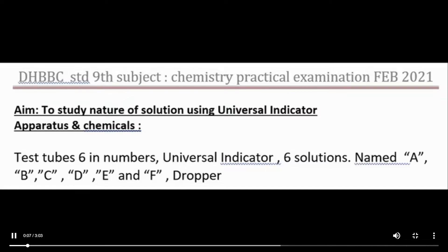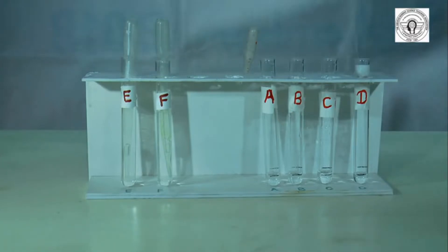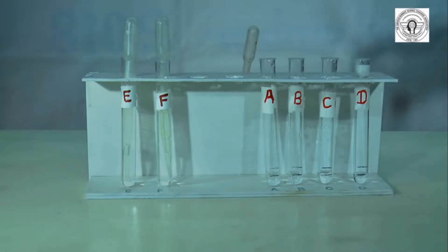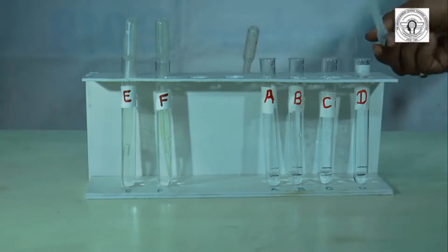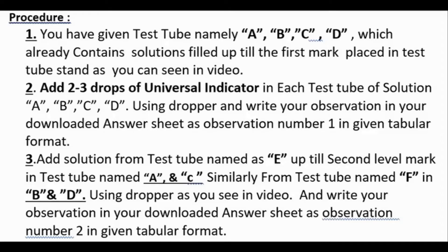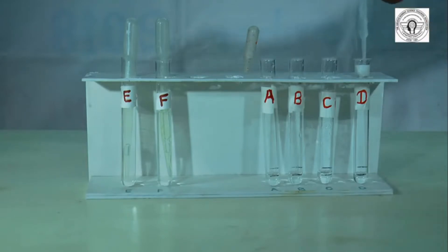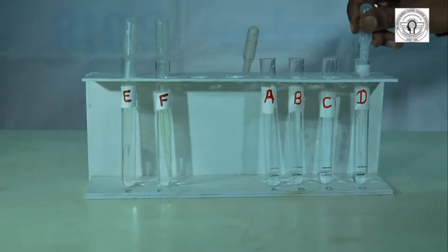9th Standard Chemistry Practical. The aim is to study the nature of solutions using a universal indicator. You are given 6 test tubes with 6 different solutions. In test tubes A, B, C, and D, you have to fill the different solutions till the first mark, as you can see here.